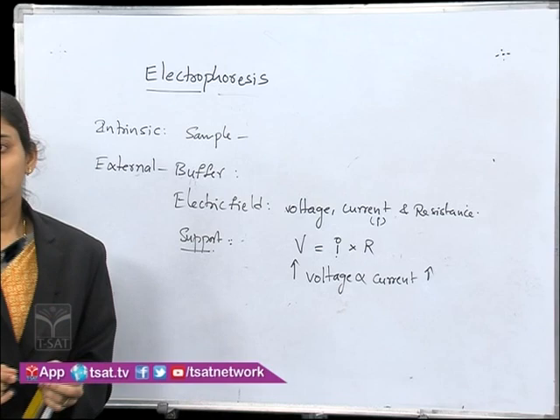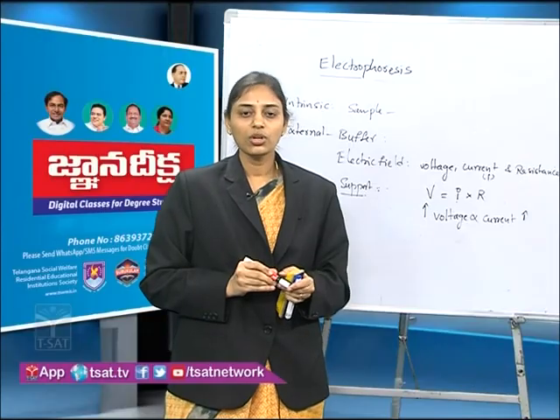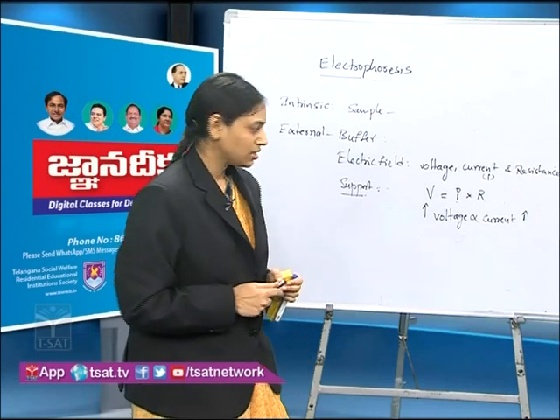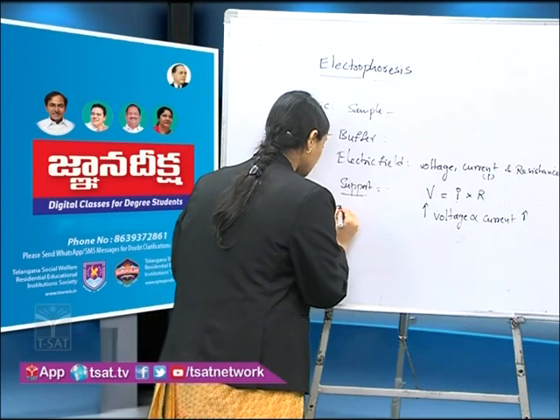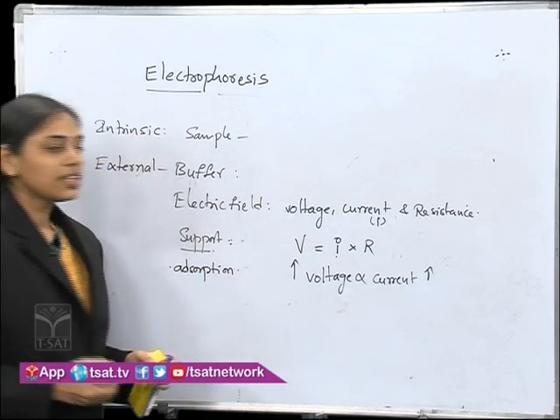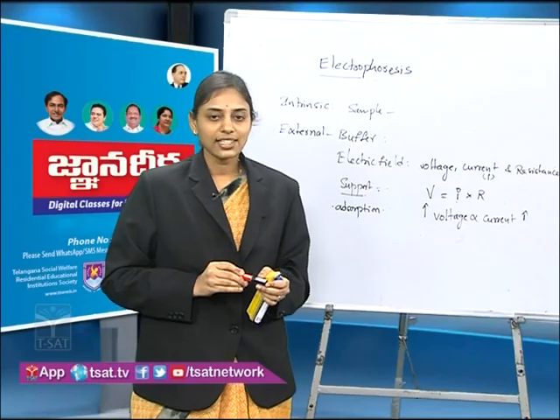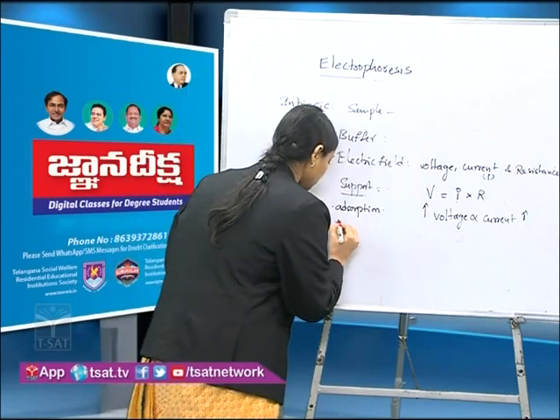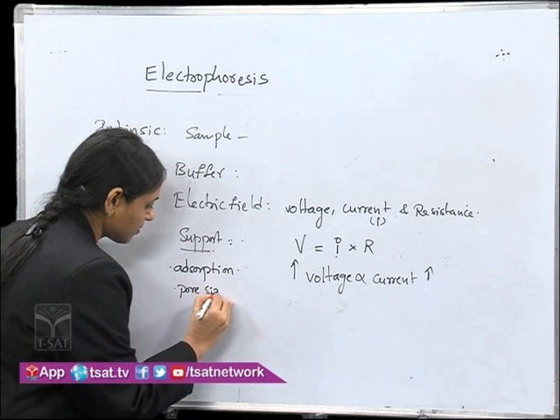This supporting material gives some time to resolve, which could be helpful to get better resolution. And it has adsorption. The supporting material should be less adsorptive. Okay. And the pore size, which I am going to talk about in a bit.